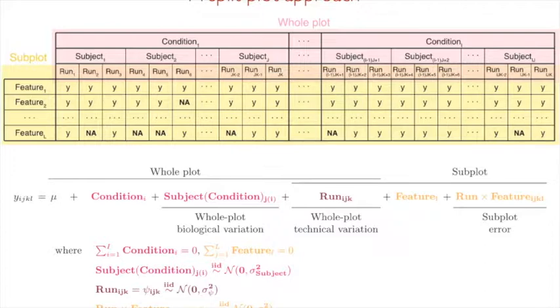And so in statistical language, this type of approach has a very specific name. It's called a split plot design. And split plot means that all the features acquired in the same run share the technological properties of the run. Then here, the set of features from the same run share technological properties of the run. And then we have to work across all the runs. And so what this means statistically is that we will decompose this model into two pieces, and we will first summarize all the intensities across all the features to obtain one number per protein per run.